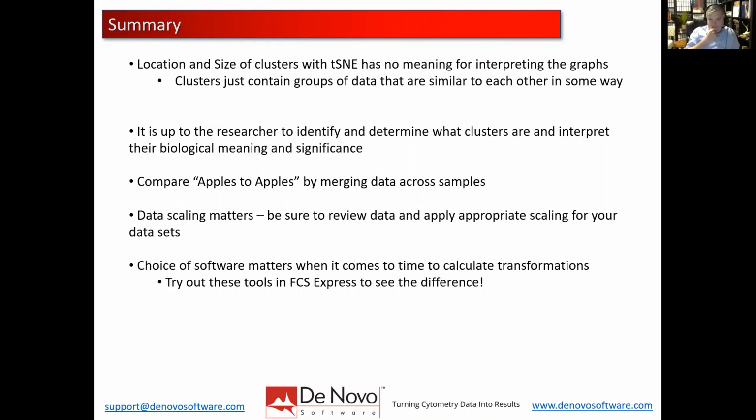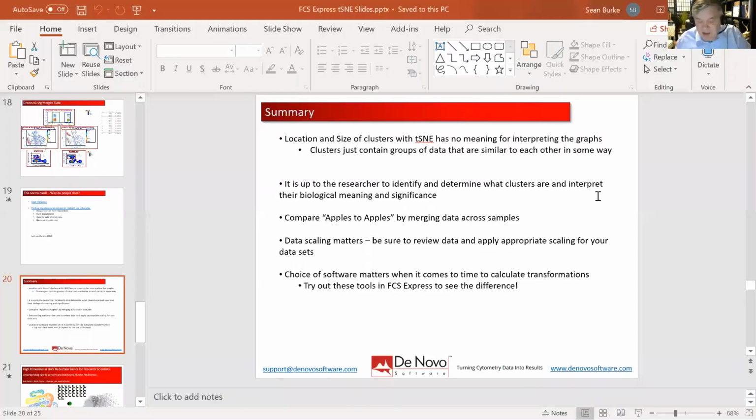And we had one more, about specifically the Barnes-Hut approximation. They asked if the Barnes-Hut approximation performs additional downsampling to the one that you initially defined when you did the t-SNE analysis. I'm going to have to double check, honestly, but I believe it does not.